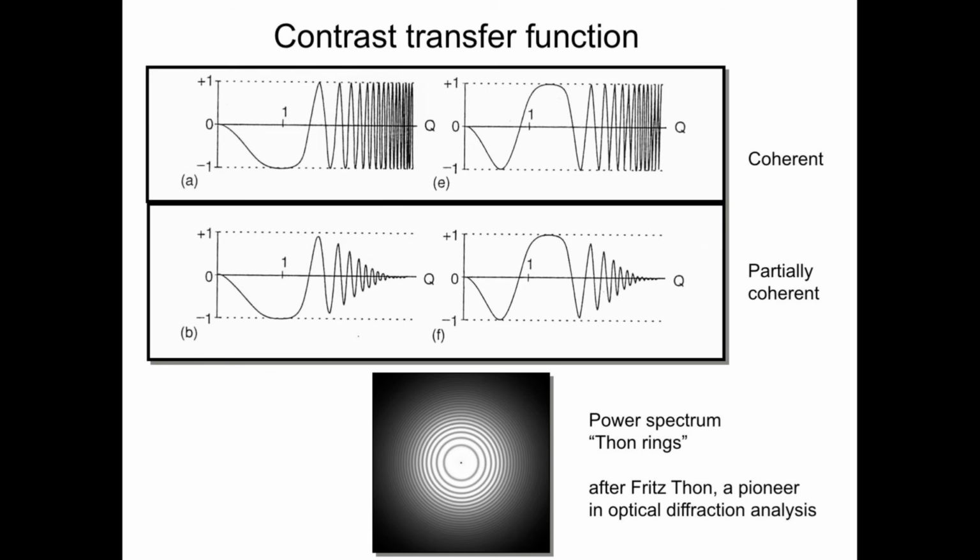The instrument only allows certain frequencies in. So without this Fourier transform of the amorphous object, we wouldn't see the power spectrum. Now, of course, it doesn't need to be carbon. It can be any amorphous material. But as soon as it gets periodic, then the information is concentrated only on a few spots, and then we don't see this anymore.